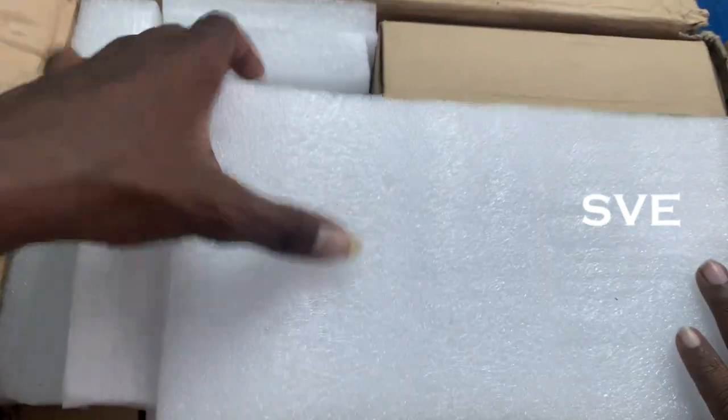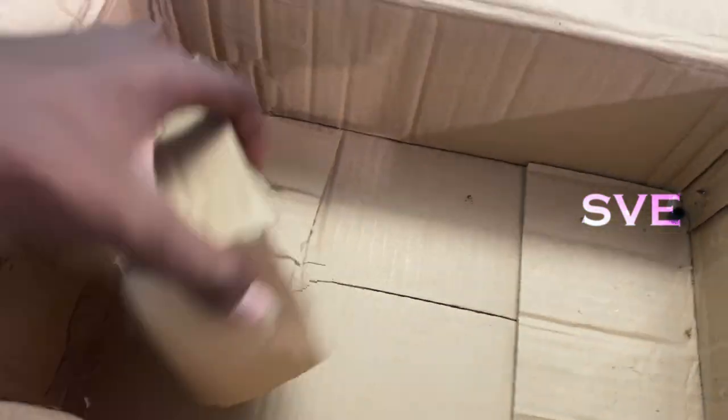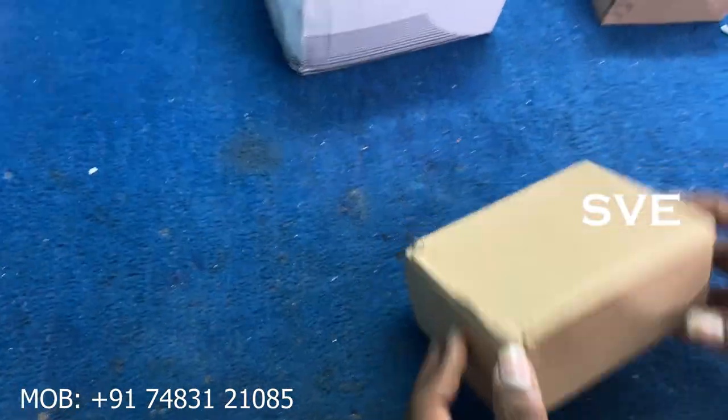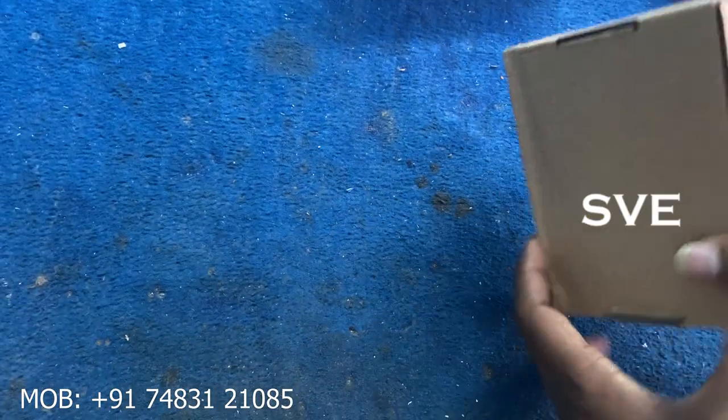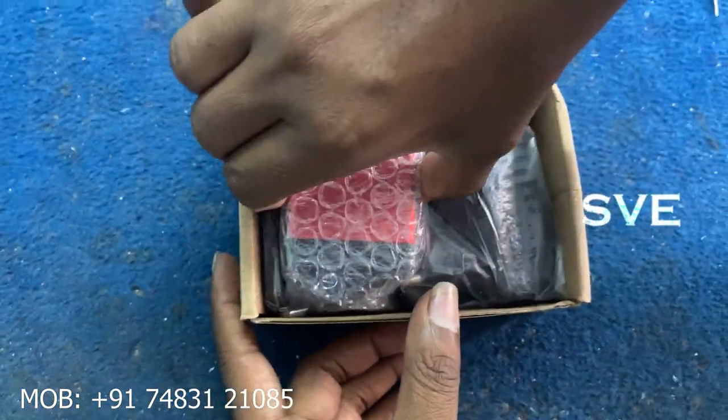This is the package box. Inside this box, there are 3 boxes. Let's see what's inside the first box. In the first box, you can see one adapter and one camera and one remote also.